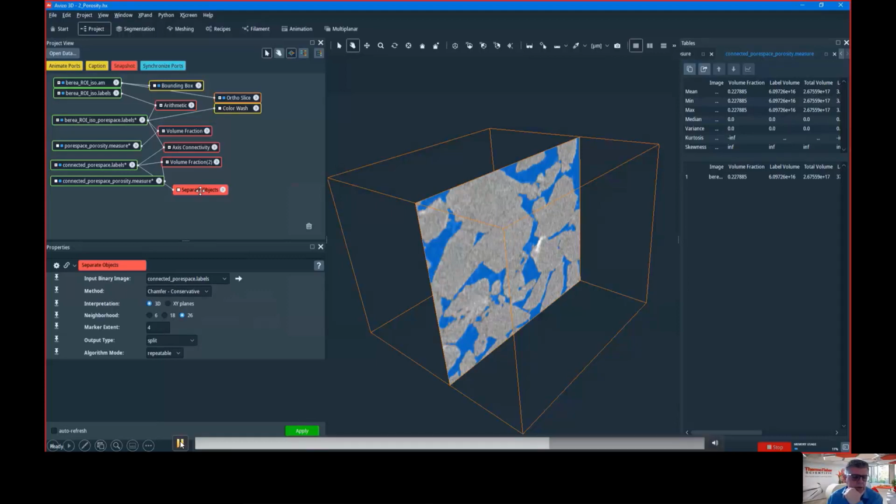So I have to use the skeleton aggressive method. I will not explain why, but I have to trim some parameters, like connected object fast, and I think I can apply. I'm not going to explain all the details. That's too long. It's a powerful algorithm that splits. You can guess that splitting pores in 3D is not trivial.